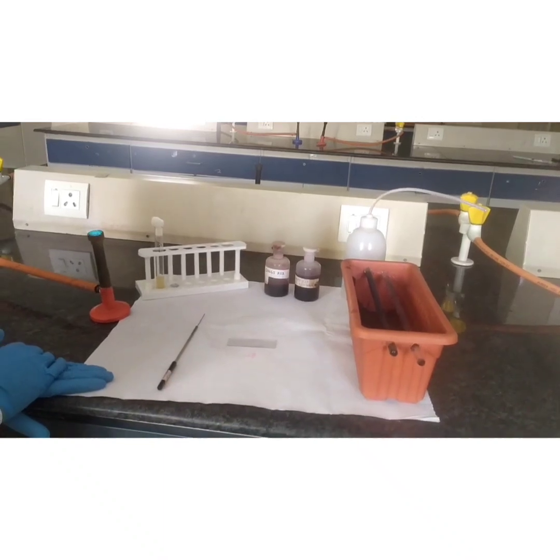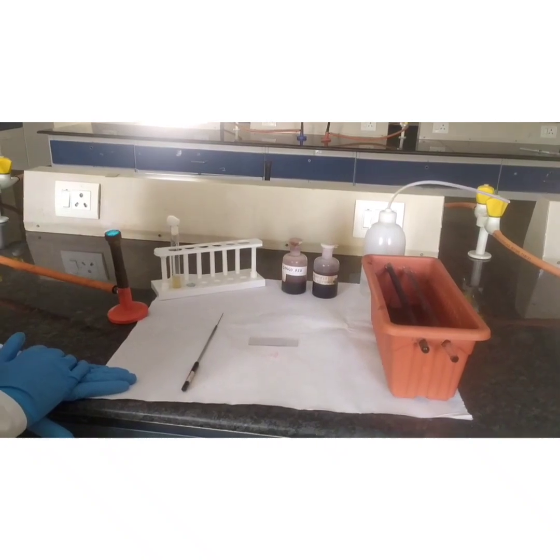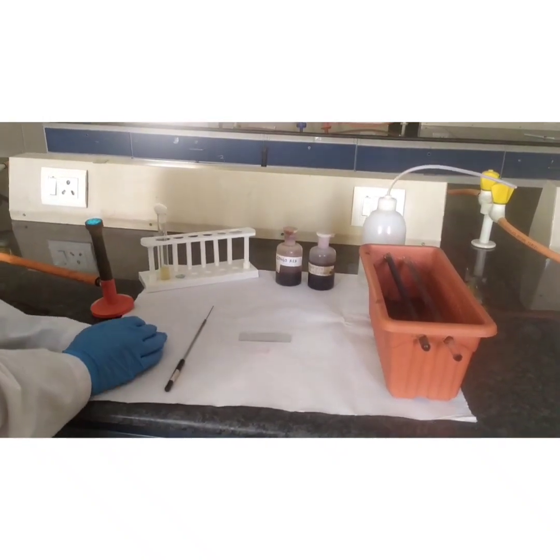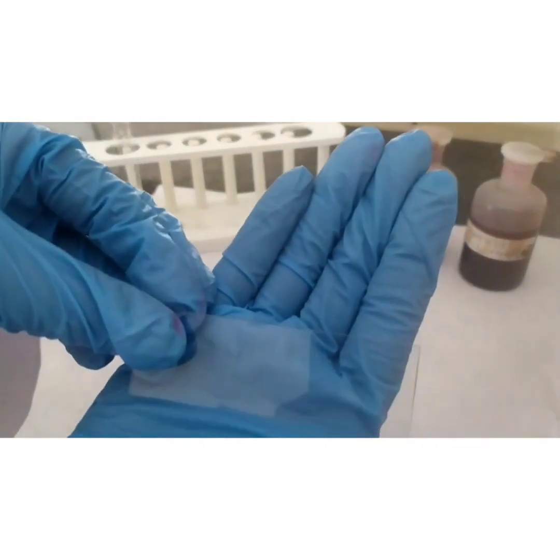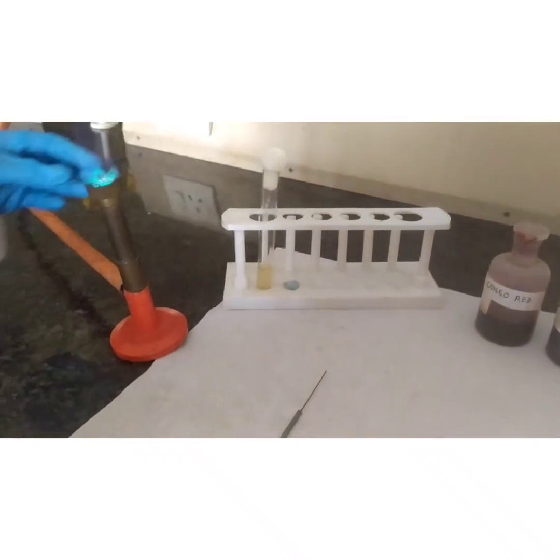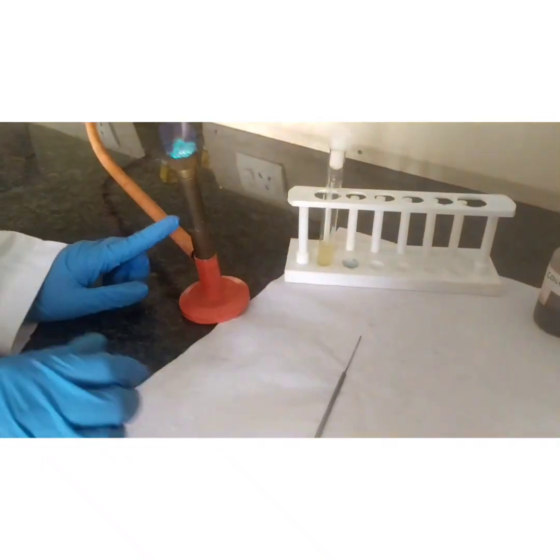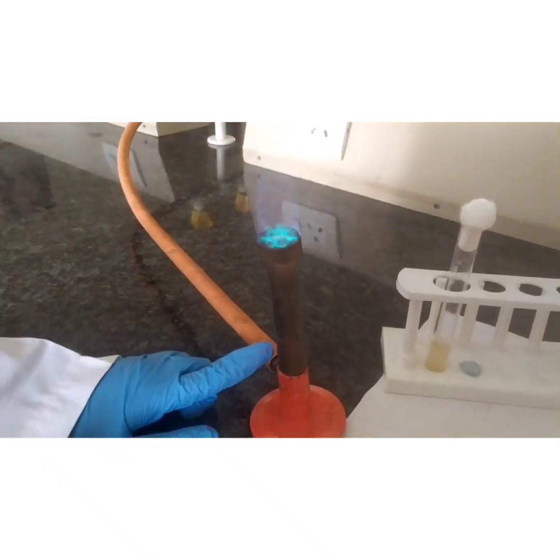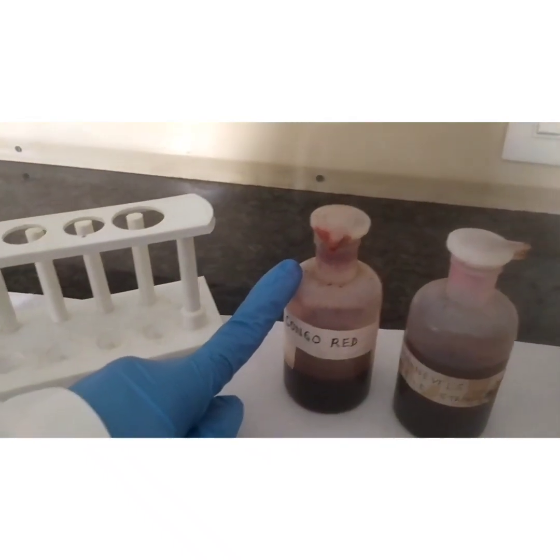Here let us see the practical representation of capsule staining. The requirements for capsule staining are a clean grease-free glass slide, bacterial culture, capsulated bacterial culture, inoculation loop, Bunsen burner, and the stains which are Congo red and Maniwal stain.